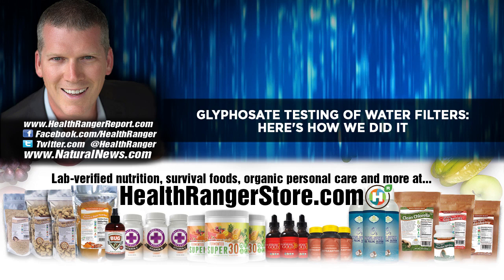But we came up with a way to use 1/40th the amount that was recommended by some of the other papers and still get these amazing results and also have a very fast clean out in less than 5 minutes. And the run itself is only a 6-minute run. And it is astonishing. Now, the real credit goes to the people that make this column. We are just the scientists trying to sort out the best way to use it. But the miracle of all this is found in the column itself, which is made by some freaking chemistry geniuses somewhere who have dedicated their lives to chemistry and obviously are the best in the world at what they do. I could never hope to be that good at chemistry, and that's not my goal. I'm not a theoretical chemist or anything, but us being able to use their chemistry has given us an incredible tool for public safety and transparent science.